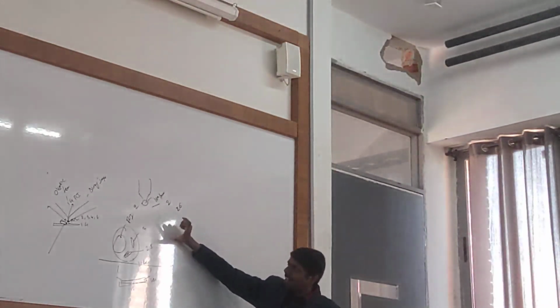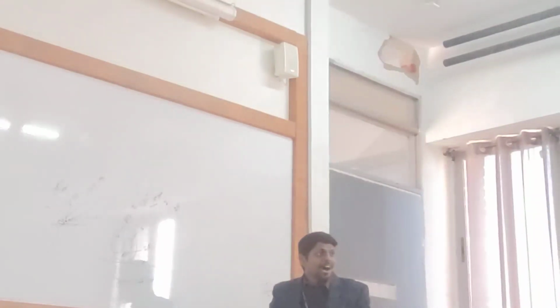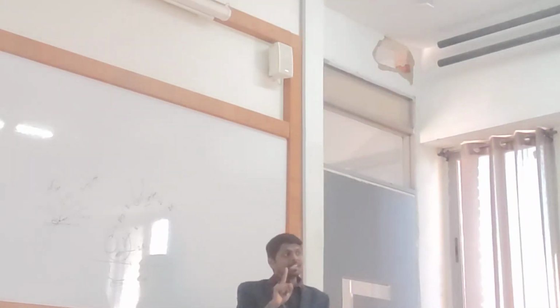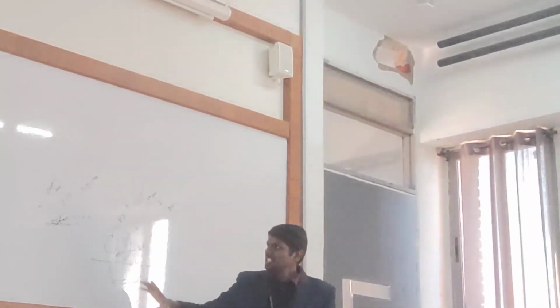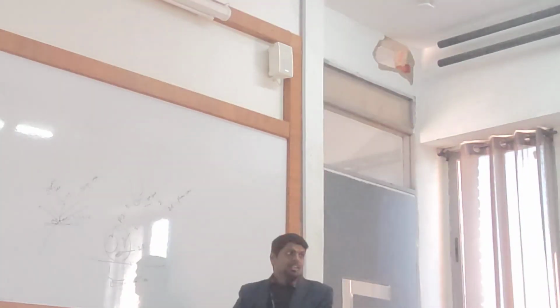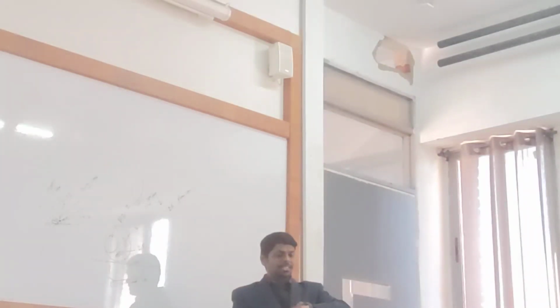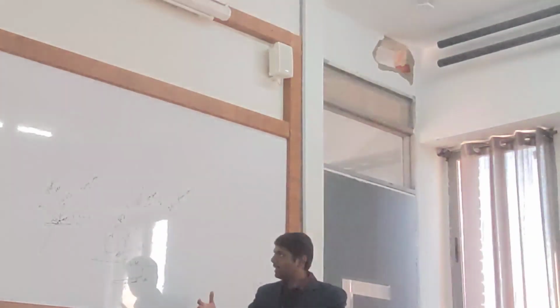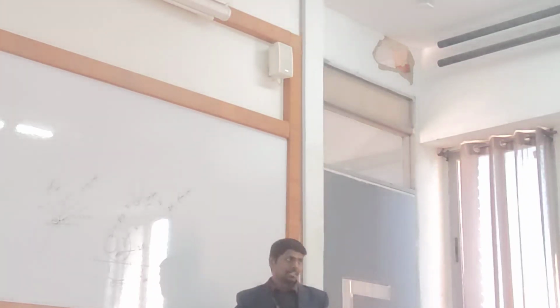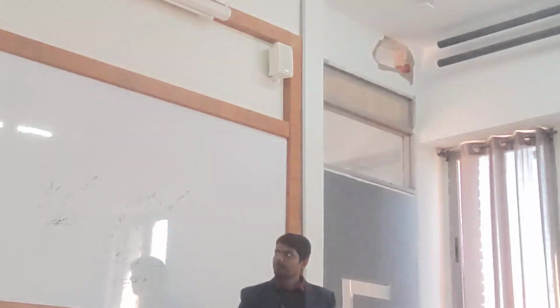So by changing the phases of the refraction of the light, I can see multiple intracellular components in a single cell. This is possible with the phase contrast microscope. In the phase contrast microscope, I was changing the refractive index of the light. I was changing the phases of the refracted light. Hence, I can see the internal components of the cells. That is the purpose of the phase contrast microscope.